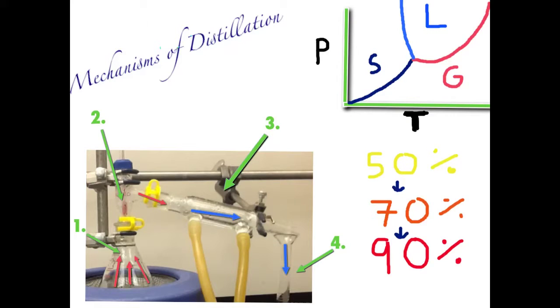So what's happening during distillation? Well, the mechanisms are easy to follow. Initially, the solution is continuously heated, and the mixture will evaporate and flow in an upward direction into the condenser, where the vapors will experience a cooling effect from the water flow that's traveling in the opposite direction. We record the temperature of the vapor just before it cools off at about half milliliter intervals, and by cooling the vapor, it returns into its liquid phase and is eventually collected in the receiver.